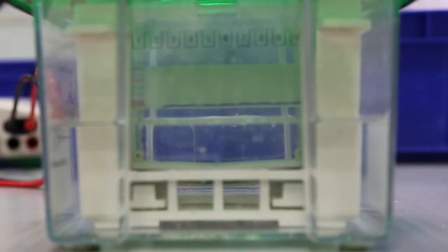During the analysis, bands will gradually form as the sample and standard move along the gel.